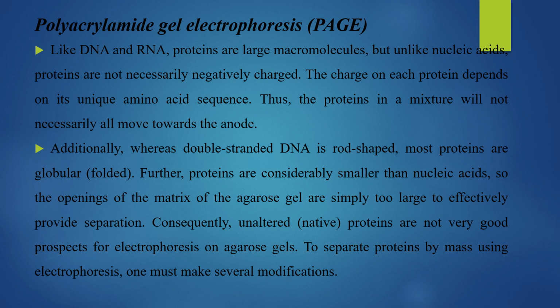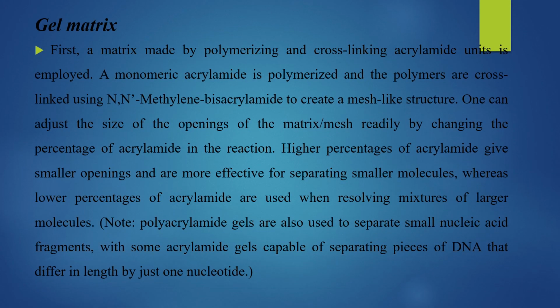To separate proteins by mass using electrophoresis, one must make several modifications. So if you want to use PAGE for proteins, you have to make modifications before it will work perfectly for your situation. So modifications need to be made to accommodate this.